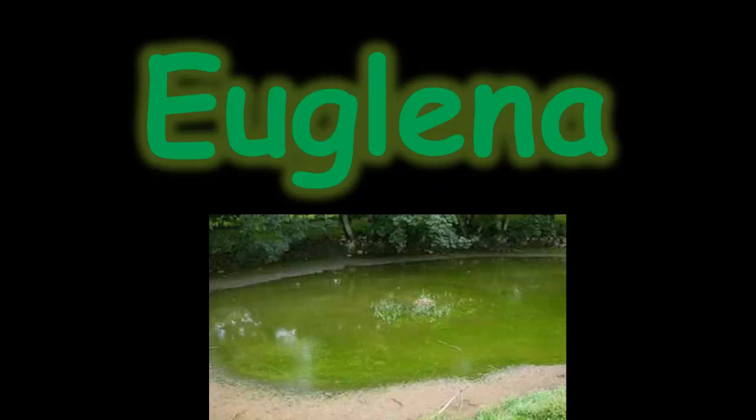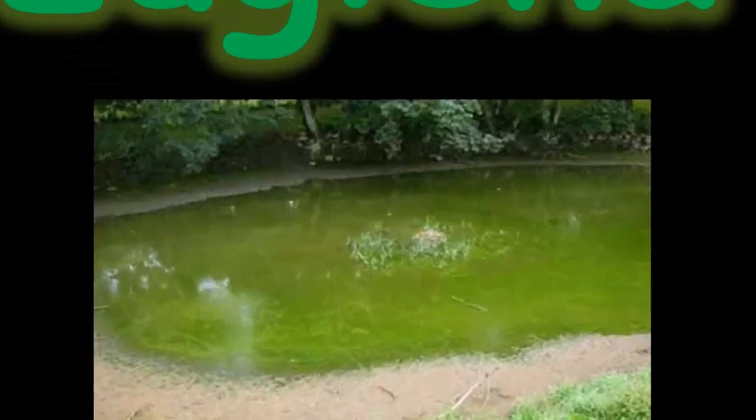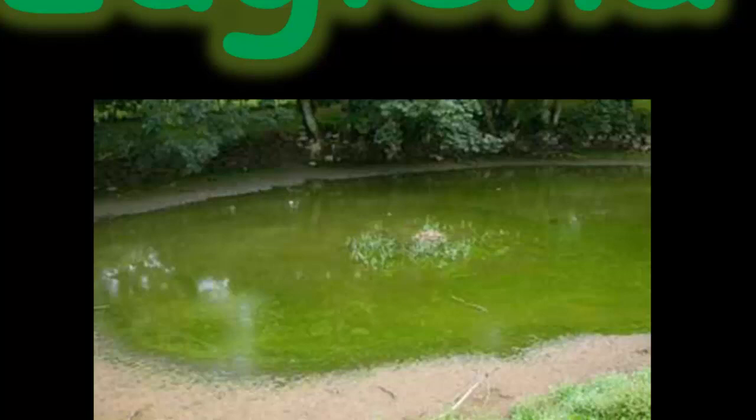Today we're going to have a look at an organism called Euglena. Euglena is found in fresh water. A lot of people know it as that green slime that forms on the surface of stagnant water.